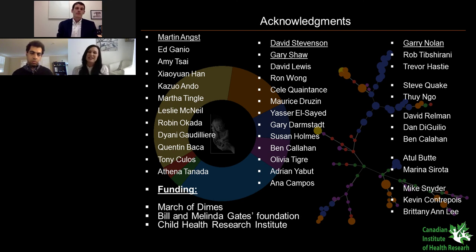Our first question is, you use mass cytometry to define the immune clock of pregnancy in peripheral blood. What about the local immune mechanisms in the feto-maternal interface?